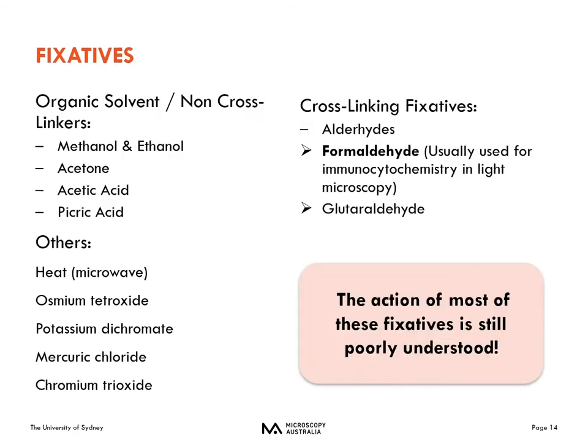There are two major types of fixatives, organic solvents and cross-linkers. Organic solvents are such as methanol, ethanol, or acetone. Cross-linking fixatives are usually aldehydes such as formaldehyde or glutaraldehyde. Formaldehyde is usually used for immunocytochemistry in light microscopy. Other chemicals such as osmium tetroxide can be used as a post-fixative for lipids. Actually, the action of most of these fixatives is still poorly understood.